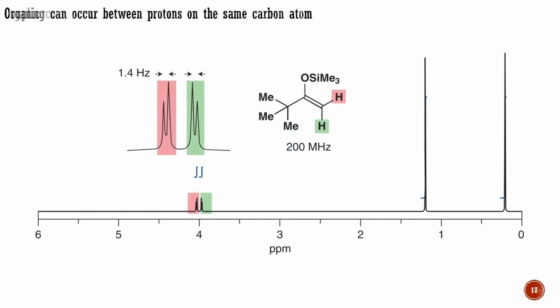In the lecture covering the alkene region in proton NMR spectroscopy, we have seen cases where protons on the same carbon atom are different, such as in compounds with an alkene unsubstituted at one end. If neighboring protons are different, then they should couple. Indeed, they do couple, but in this case, the coupling constant is usually very small.